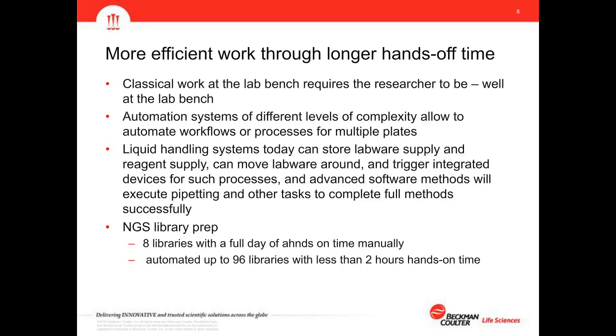Because liquid handling systems of today cannot just do pipetting, they can also store labware supply, reagent supply, they can move labware around, trigger integrated devices for such processes, such as thermocyclers or readers, and the advanced software methods will execute the pipetting and other tasks to complete a full method successfully.